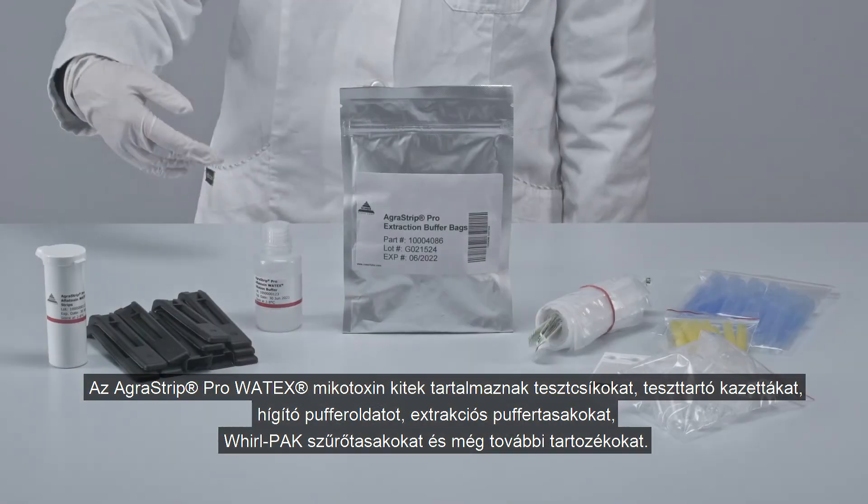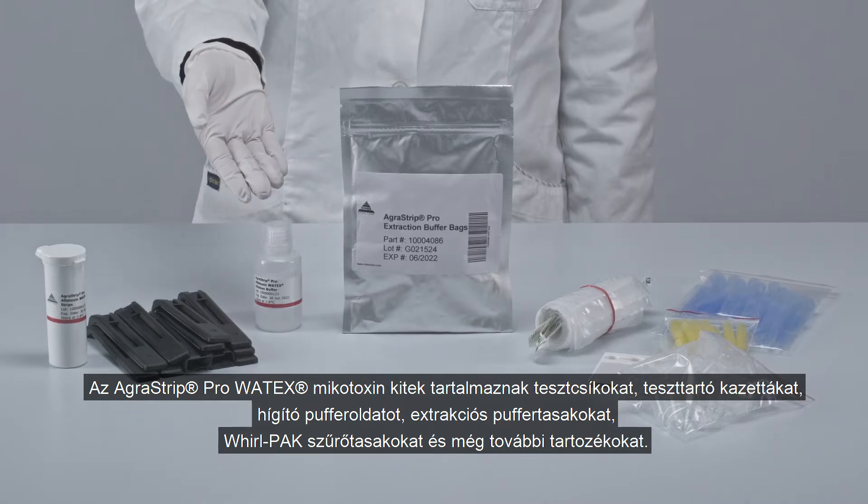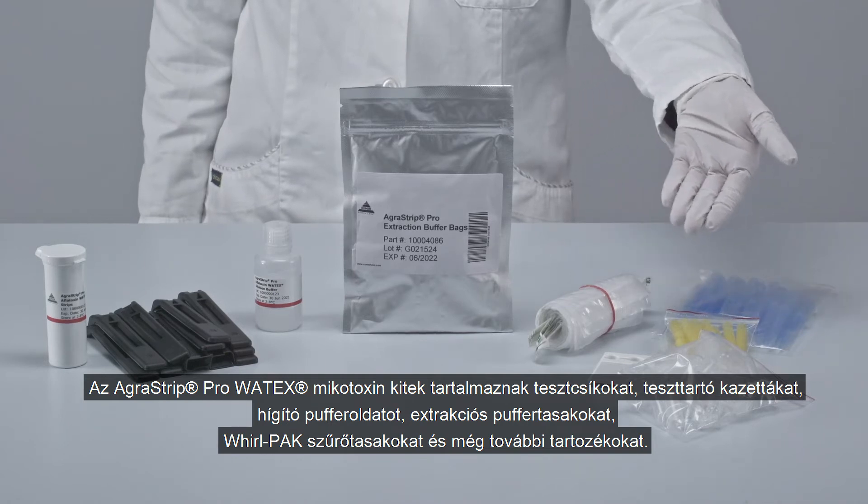AgraStrip Pro WATEX mycotoxin test kits come complete with strips, strip cartridges, dilution buffer, extraction buffer bags, Whirl-Pak filter bags, and additional accessories.